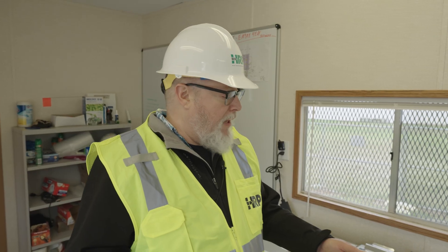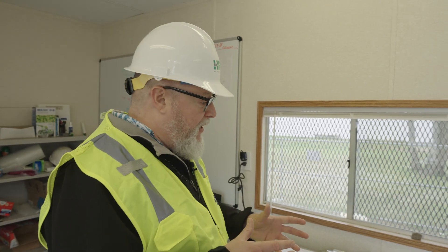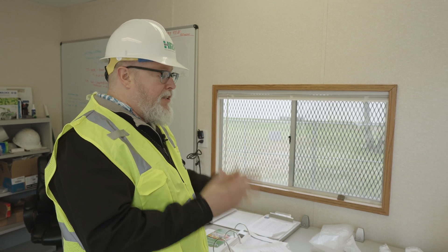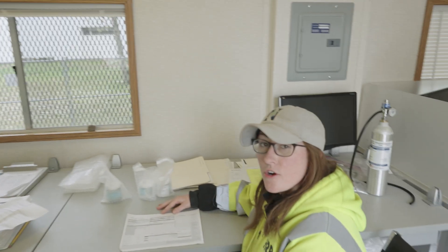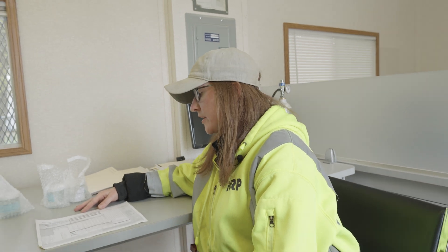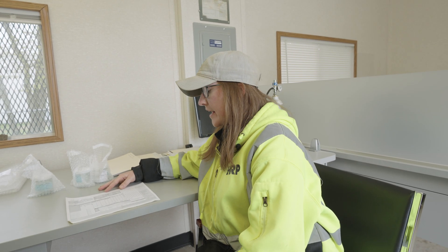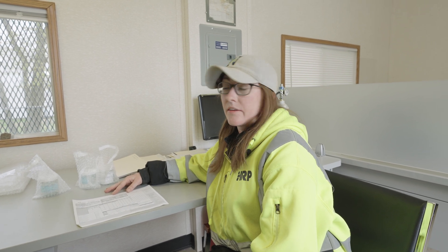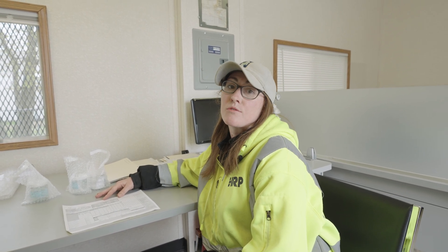The last step is filling out the chain of custody. Something to note is making sure you write down the surface area that you collected the sample from — in this circumstance, we used 100 centimeters squared. It's important to have that on the chain of custody so the lab is able to provide a valid concentration of the analytical results.